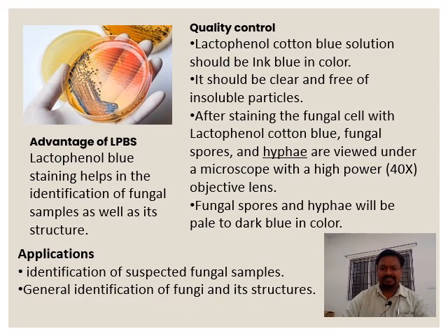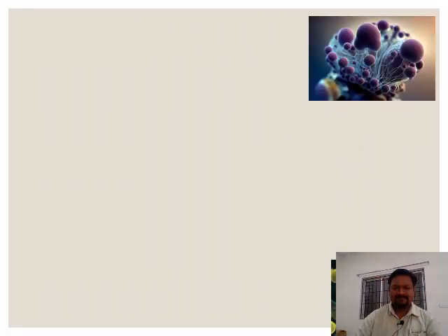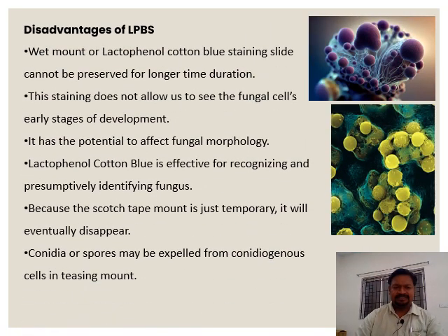Identification of suspected fungal samples. Disadvantages: wet mount or lactophenol cotton blue stains. The slide cannot be preserved for long durations. The stain does not allow seeing fungal cells in the early stage of development. It has the potential to affect fungal morphology.